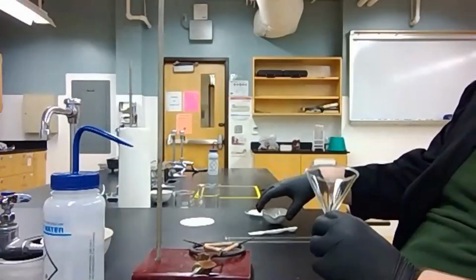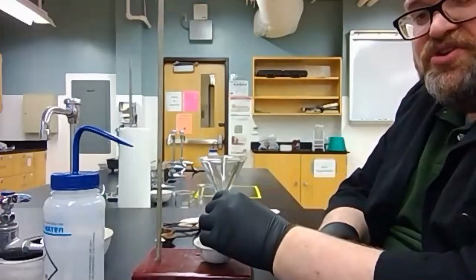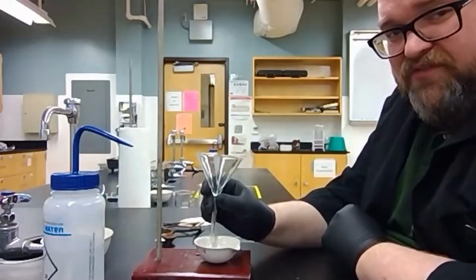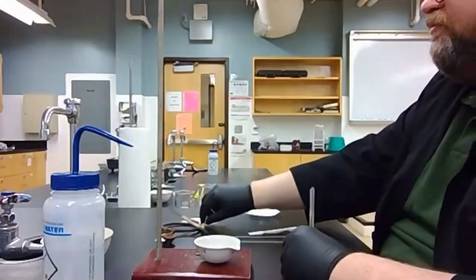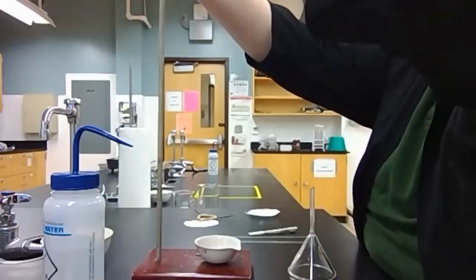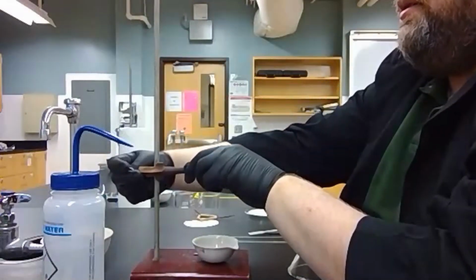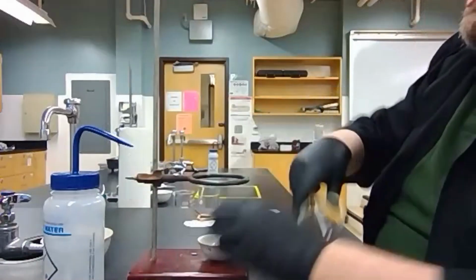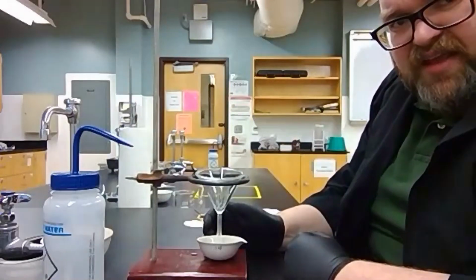So I'm going to put the funnel into my evaporating dish. But now I'm stuck holding this, and that's not very good either. So I need something to support this funnel for me. I've got my iron ring and my iron ring stand, so why not use the iron ring to do it? I'm going to attach my iron ring, lower it down, clamp it into place. There we go. And then now I can just sit that right there, and that's not very stable.